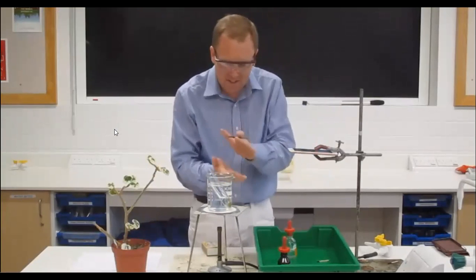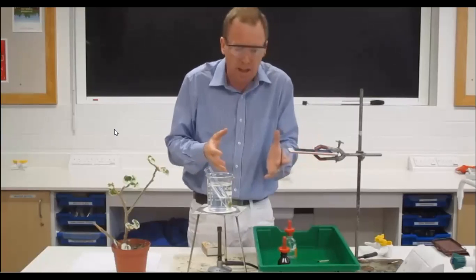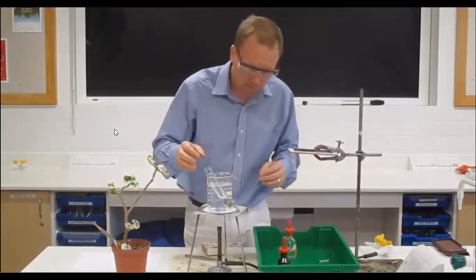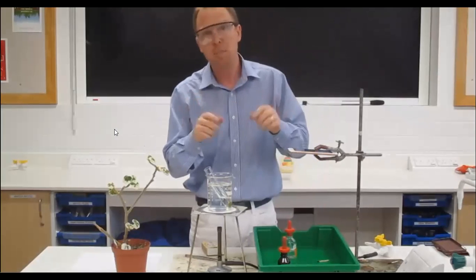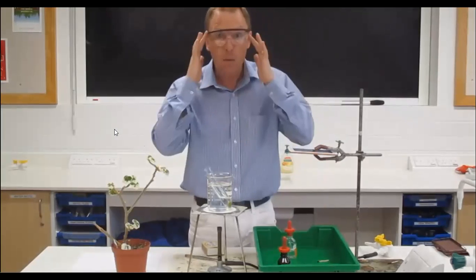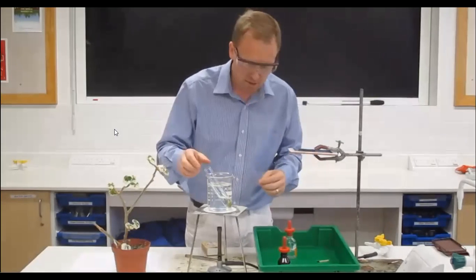What this is going to do is, the chlorophyll doesn't dissolve in water. You know that when you boil broccoli at home, you don't get white broccoli at the end of it, because the chlorophyll stays in there. It's not soluble in water. It is soluble in ethanol. And we are now going to remove the chlorophyll. That's not because we're expecting photosynthesis to carry on. It's because we're going to be doing a color test on this at the end of it, and we don't want any green pigments from the chlorophyll in place to interfere with our test.